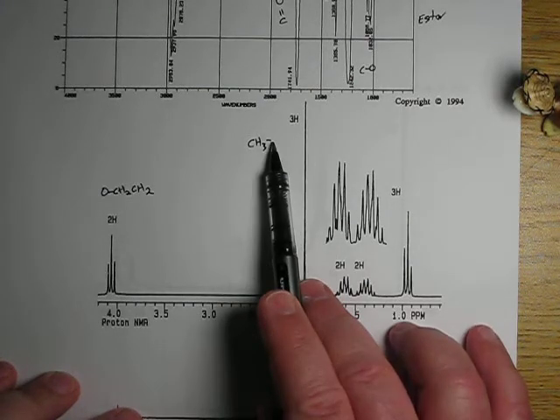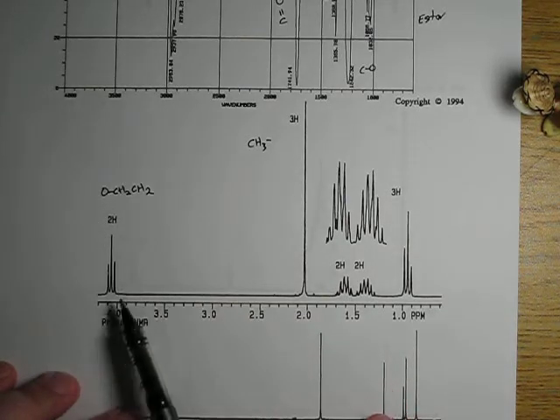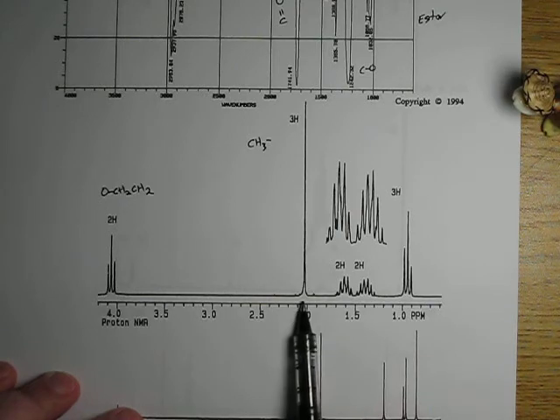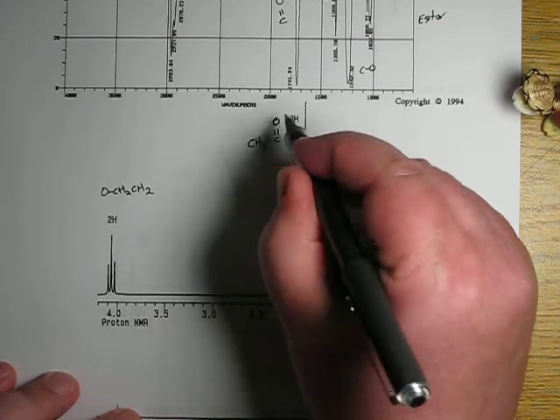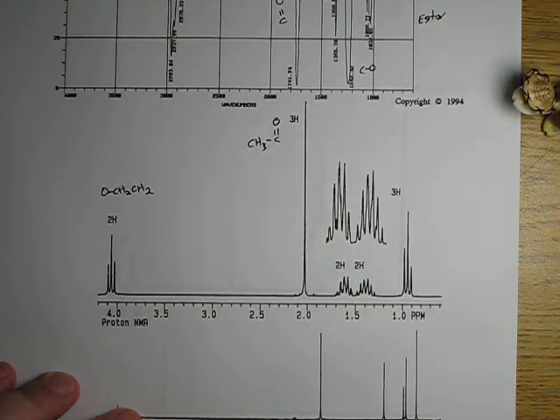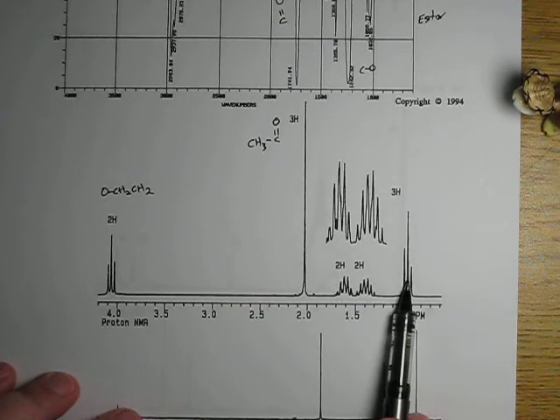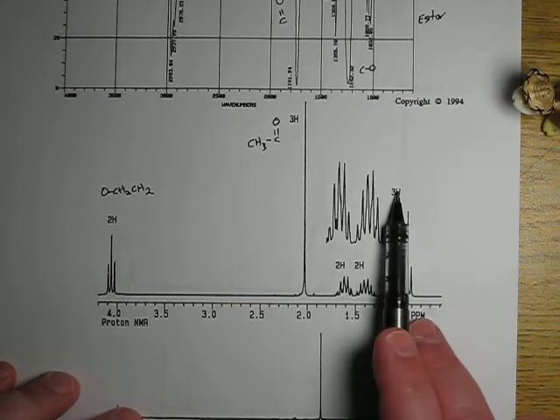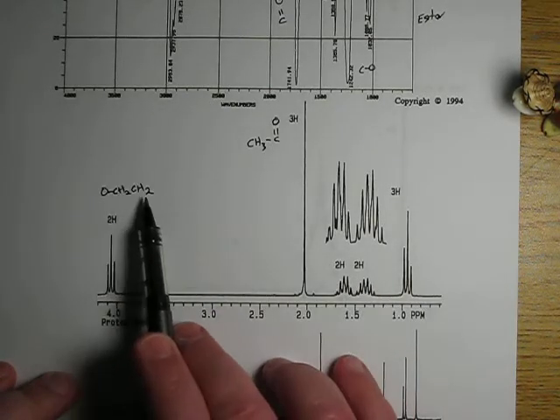Well, could it be bonded to this O? No, it couldn't be bonded to the other side of this oxygen, or else it would be down about 4. What moves something down to about 2 ppm and contains no hydrogens on it? A carbonyl does. So I'm betting you the carbonyl is bonded there. And at this point we're looking, okay, well, what else do we see here? We got 2 CH2s and a CH3. Just 2, 2, and 3 tells us 2 CH2s and a CH3. Note, one of these CH2s is this guy.